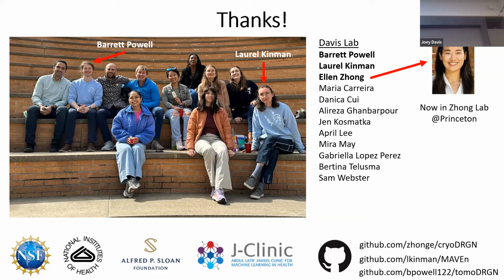I think the more interesting thing is how you go from this uninterpretable low-dimensional space that you get out of the autoencoder to something that is actually interpretable molecularly. The way we're thinking about that, and I'd love to hear other people's thoughts, is to generate a ton of volumes. Maybe you oversample extensively, so you have 100,000 volumes.